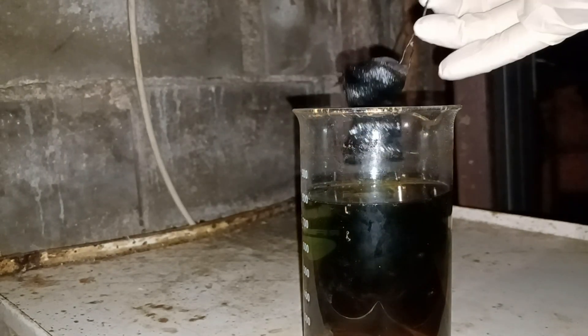This week I had to get palladium out of the solution, and boy did it take a week. Cementing palladium on copper is slow — very slow — in fact some of it is still dissolved when I am making this video.